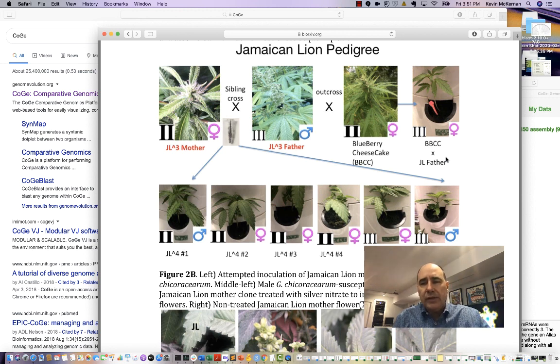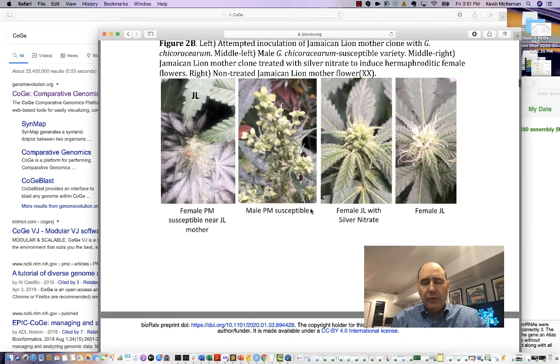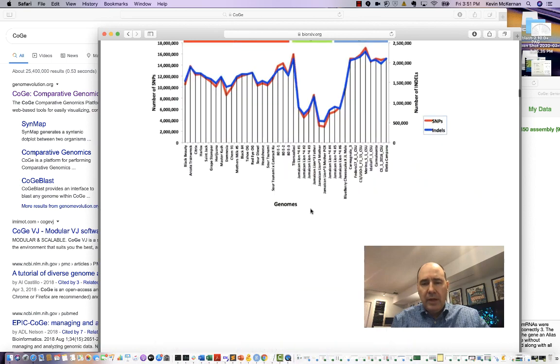And then all the other ones we put through Illumina sequencing and mapped back to the maternal or paternal reference, and you're going to see all of these BAM files in this CoGe database. There are a couple different aspects that you're welcome to read in this paper.